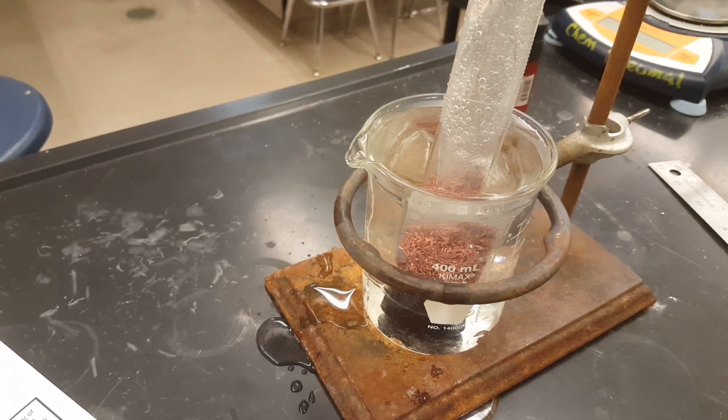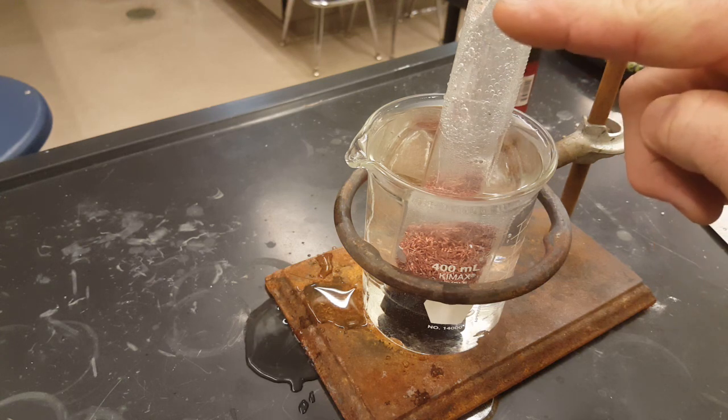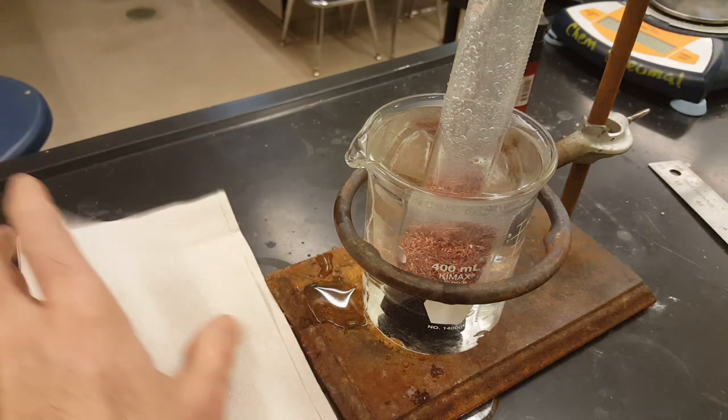It looks like I erred on the side of too much water in my beaker, and that's perfectly fine, and you can too. I'm overflowing as the hydrogen gas that I'm producing is displacing the water in the graduated cylinder. It's pushing that water down and back into the beaker. So just grab some paper towel.